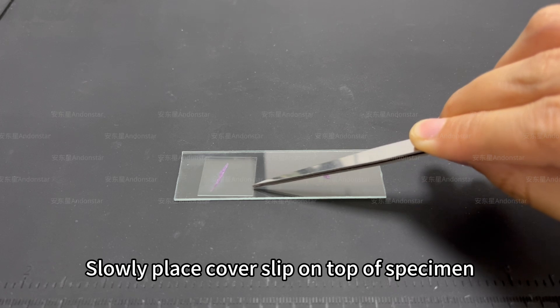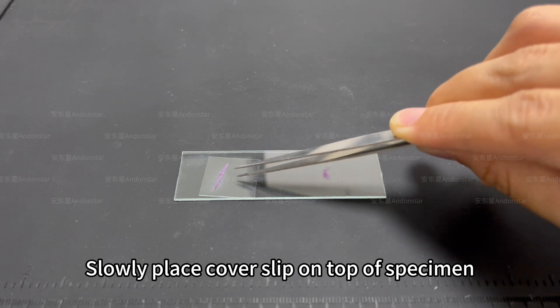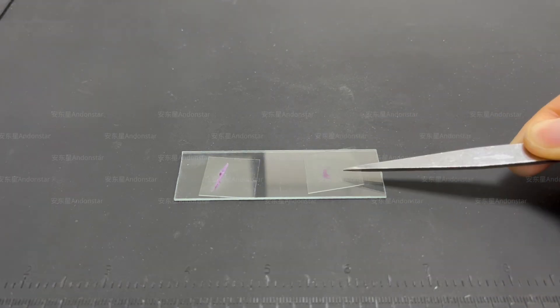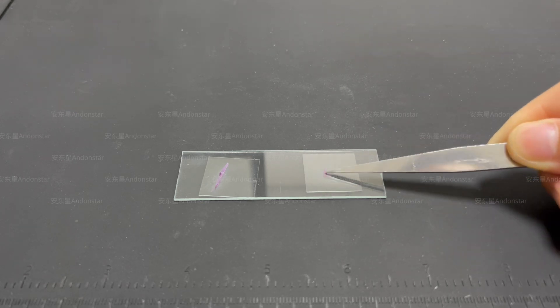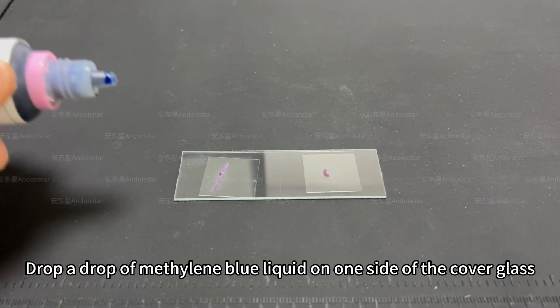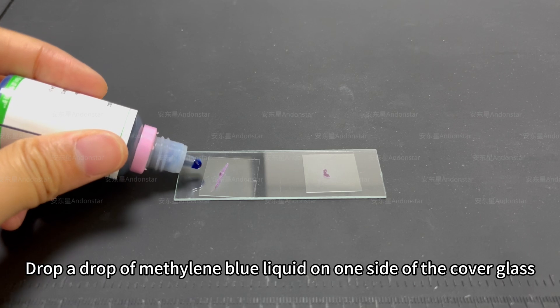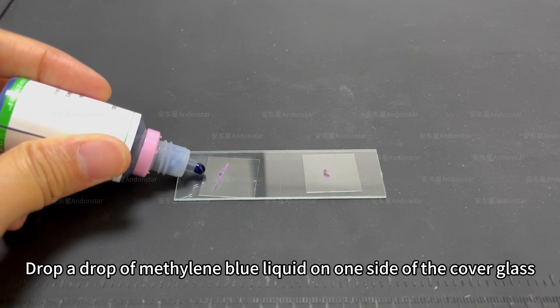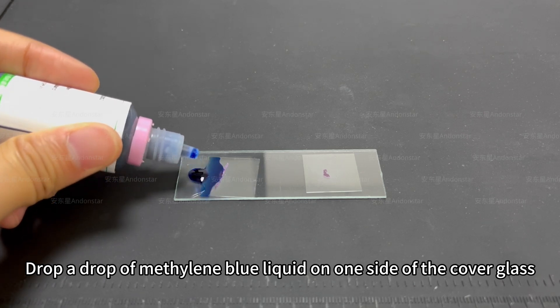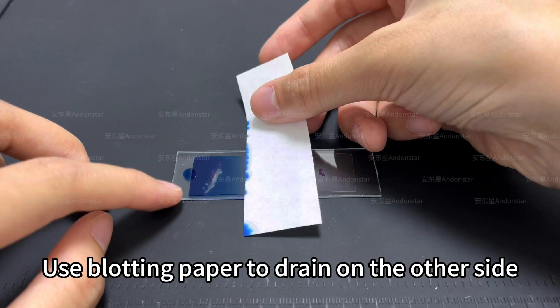Slowly place cover slip on top of specimen. Drop a drop of methylene blue liquid on one side of the cover glass. Use blotting paper to drain on the other side.